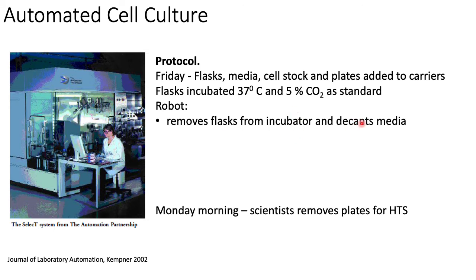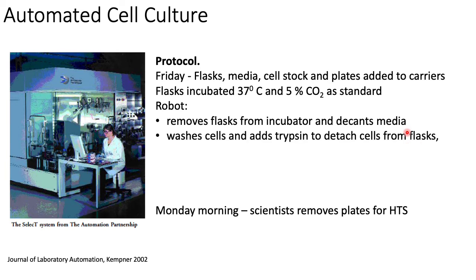What it does then is decant the media. When we grow the cells, we always add special media, which helps to keep cells alive and gives them all the nutrients and food. So it decants it, and then it needs to wash the cells.